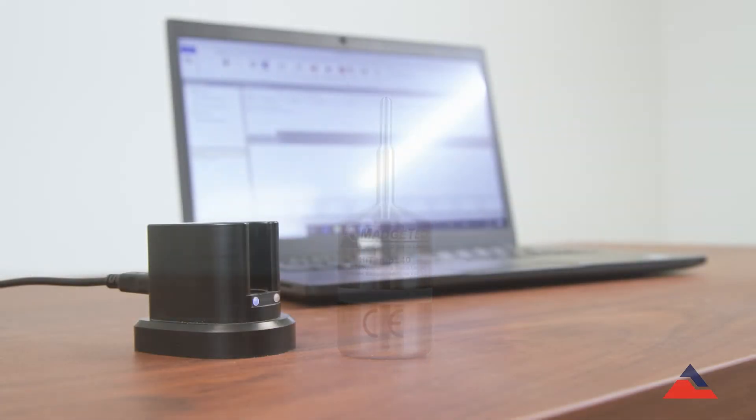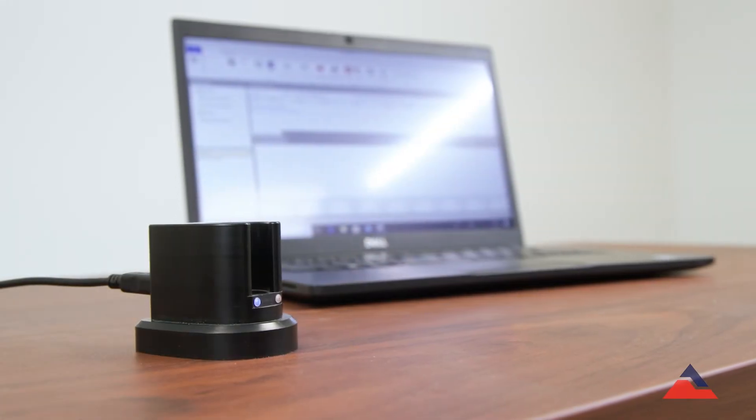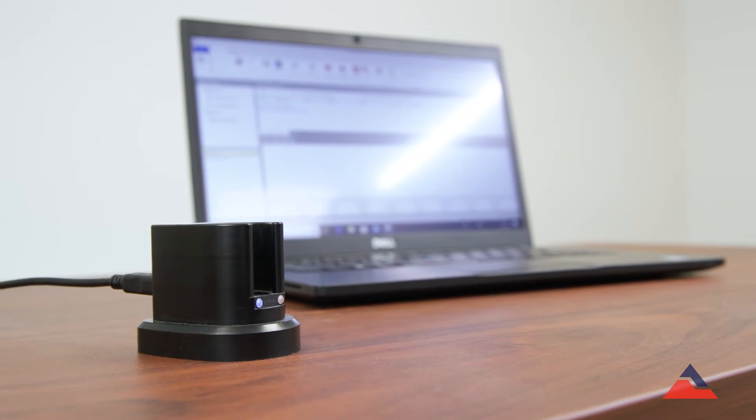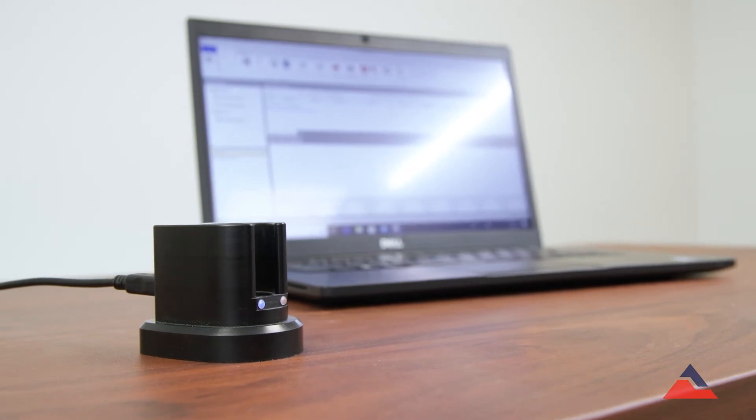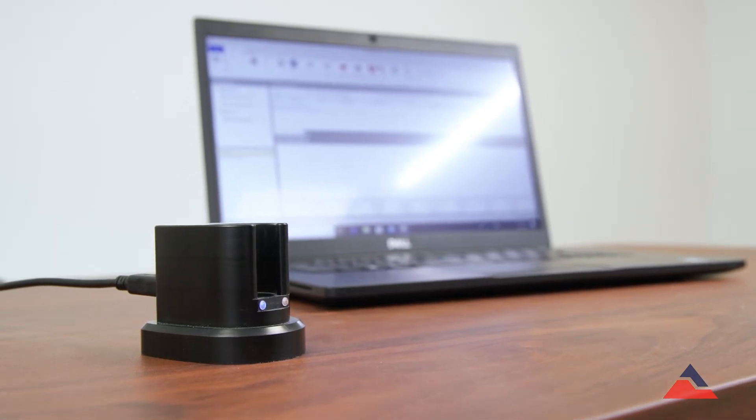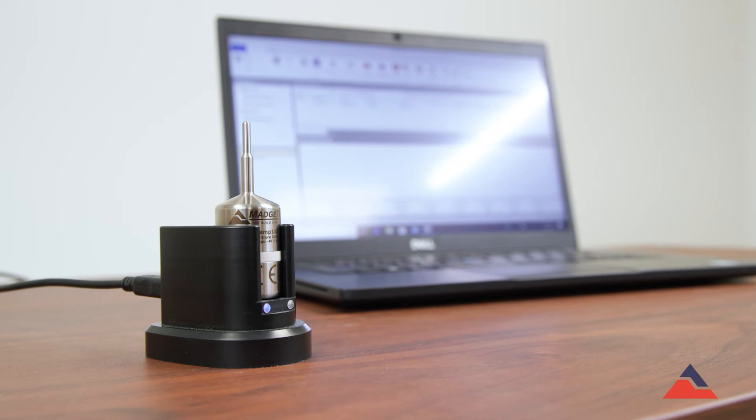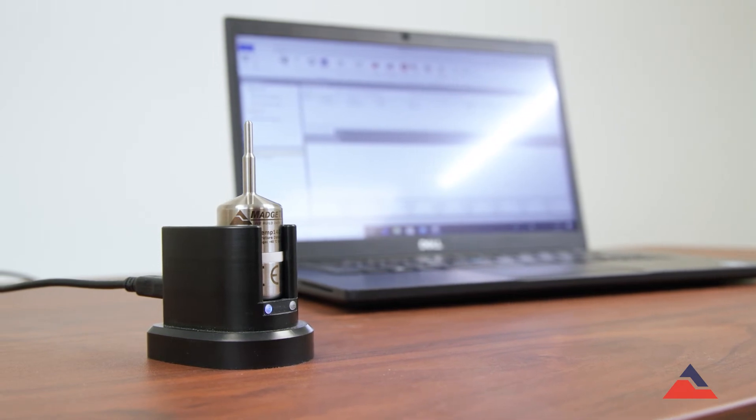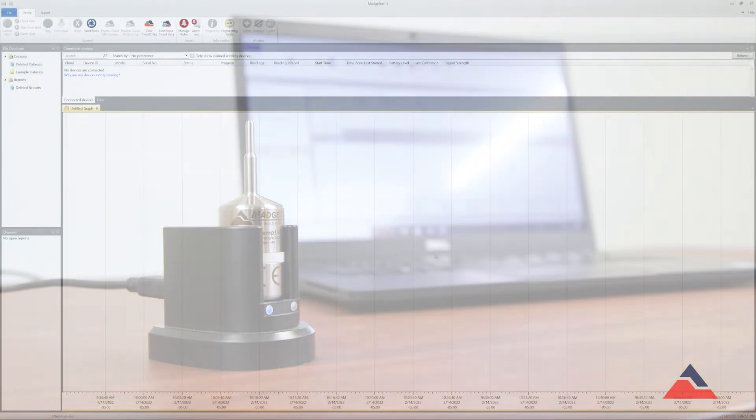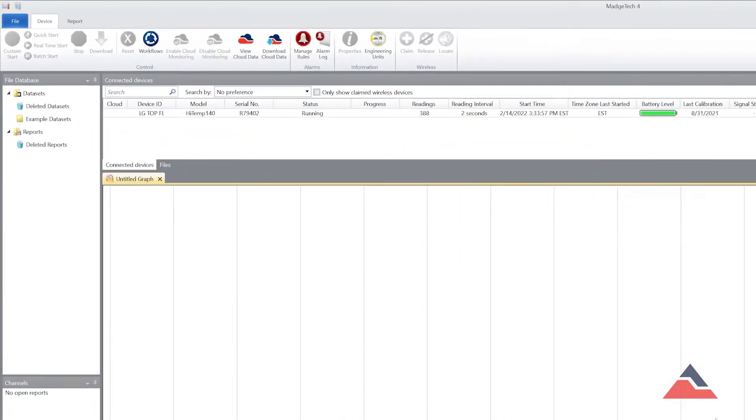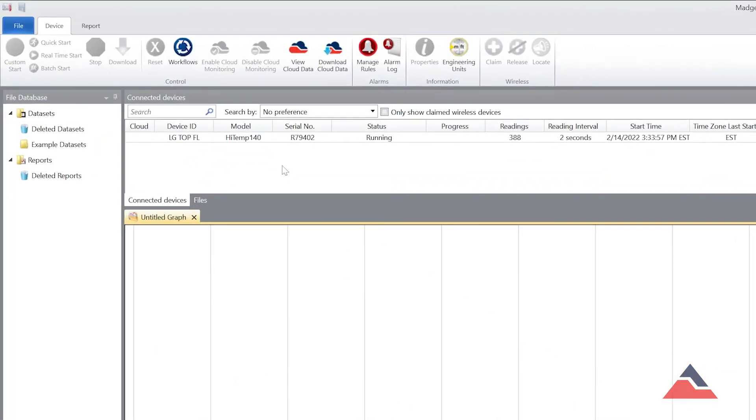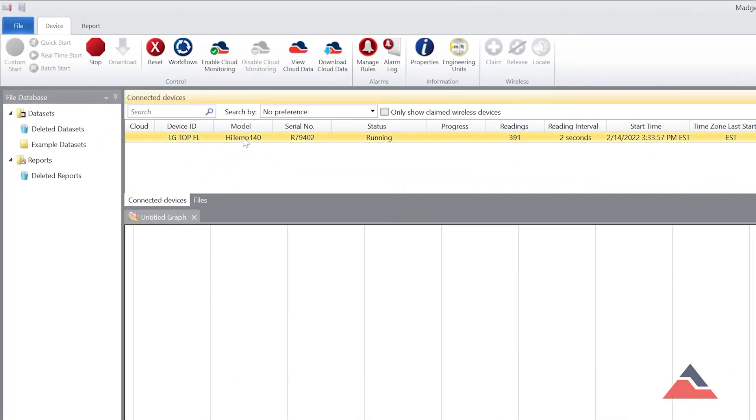After your study is completed and the High Temp 140's body is returned to room temperature, you may download the data from your logger by first placing it in a docking station connected to your computer. If you did not set an automatic stop time, highlight the logger under your connected devices list and select Stop in the menu bar.